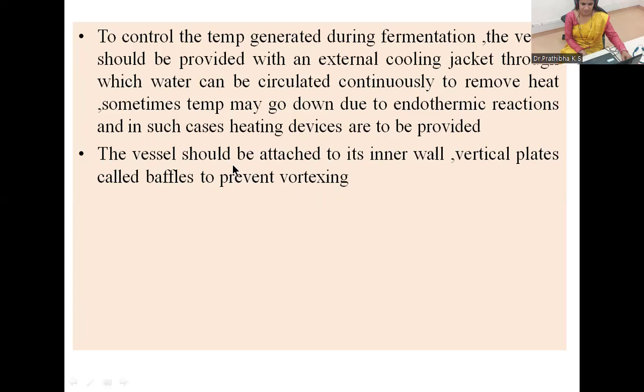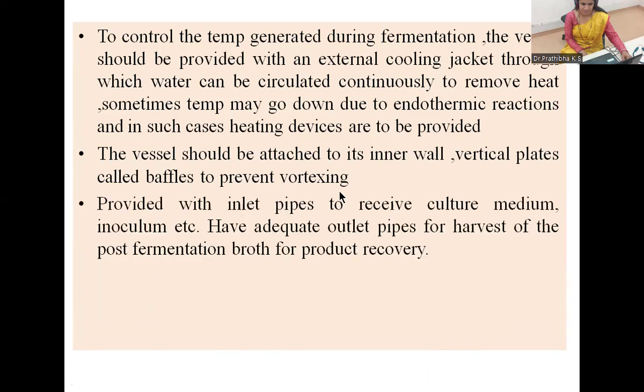The fermenter vessel or bioreactor should be attached to its inner wall, which looks like vertical plates, which are used to prevent the vortexing or swirling. ಈ ಸುಳಿ ಅಂತ ಹೇಳ್ತೀವಲ್ಲ, ಆ ಸುಳಿ ಅಥವಾ swirling ಆಗೋದನ್ನ ಅವಾಯ್ಡ್ ಮಾಡೋಕೆ we are using this particular baffles.